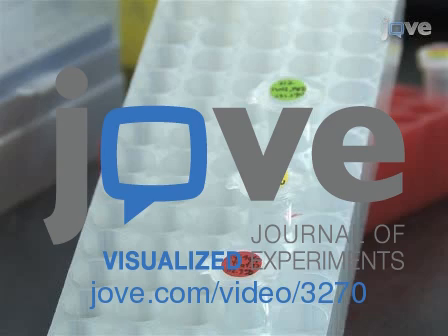Hi, I'm Ray Hong, California State University, Northridge, and this demonstration will outline the steps for genetic manipulation in Pristionchus pacificus nematodes, an emerging model organism. Performing RNAi and transgenesis can answer key questions in developmental biology and behavior by characterizing gene functions and expressions.